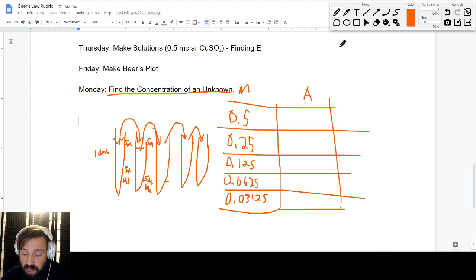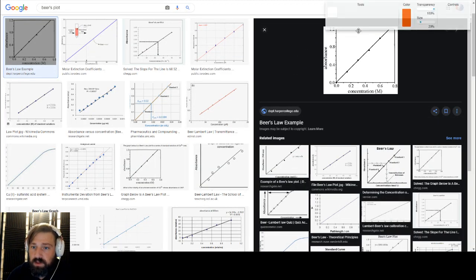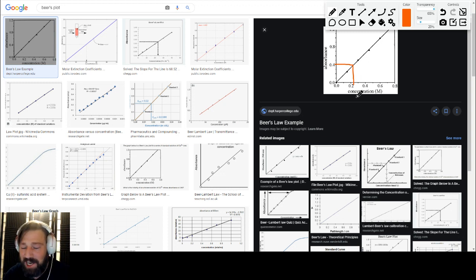I'm literally just going to hand you a test tube that's labeled 1 through 32, and you're going to take it, put it into your spectrophotometer, and find the absorbance. If it's 0.4, you'll go down and say it's 0.24, and you'll get credit for your hard work. Good job. And that's basically it.